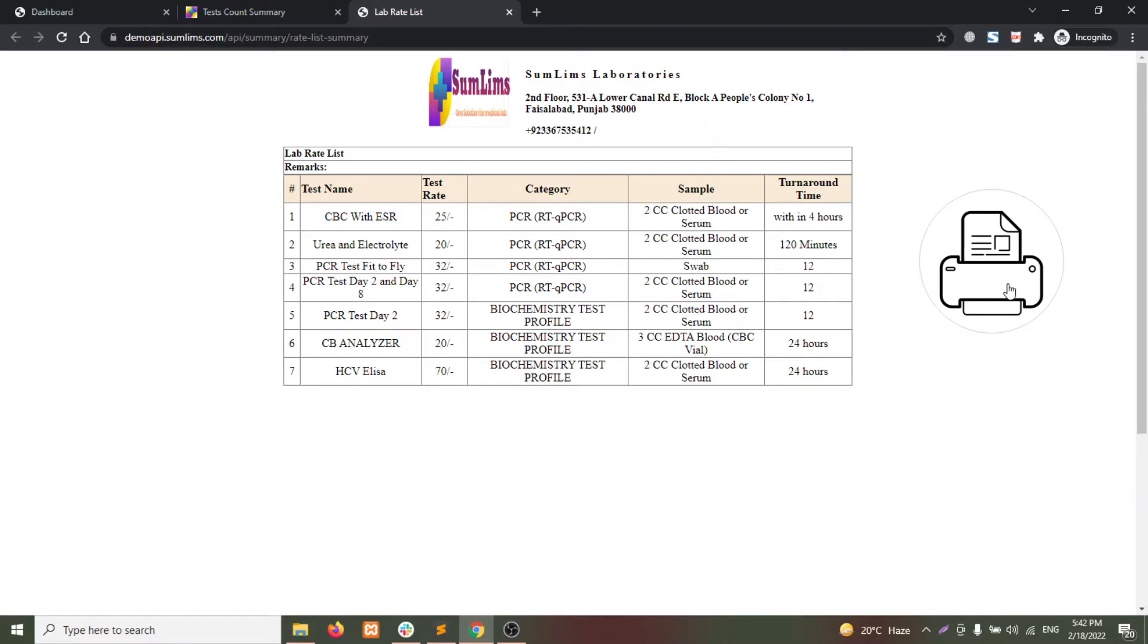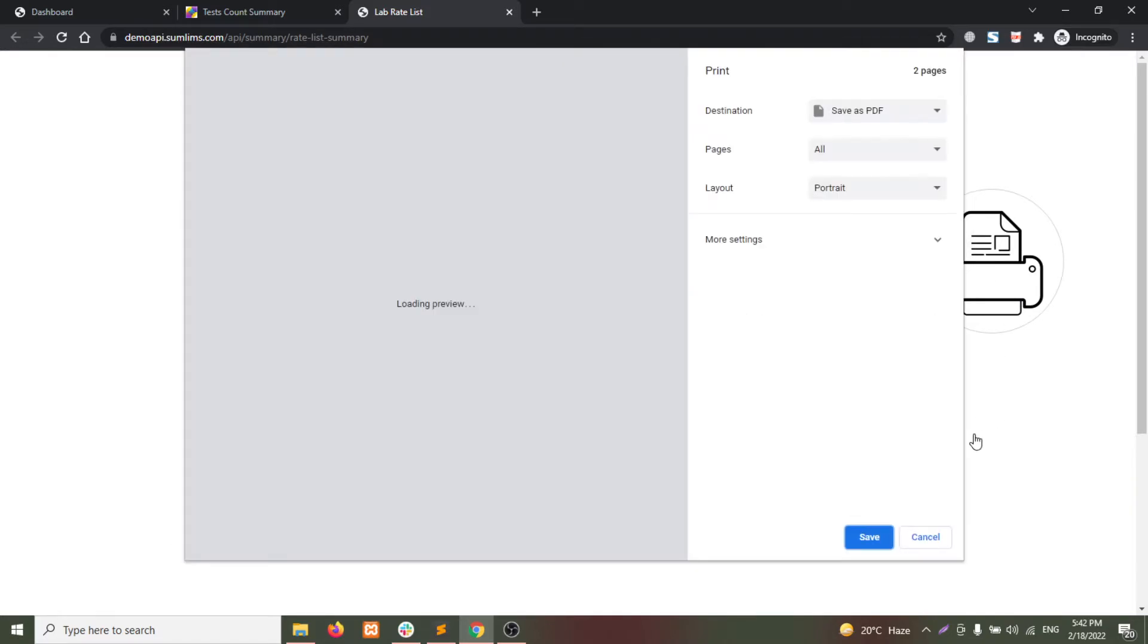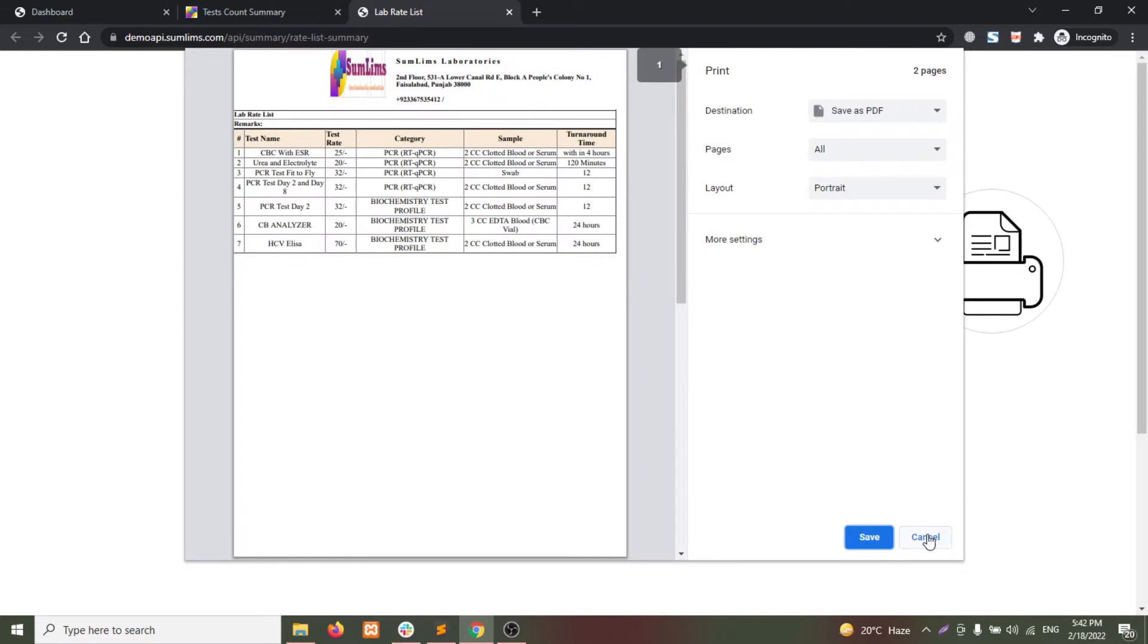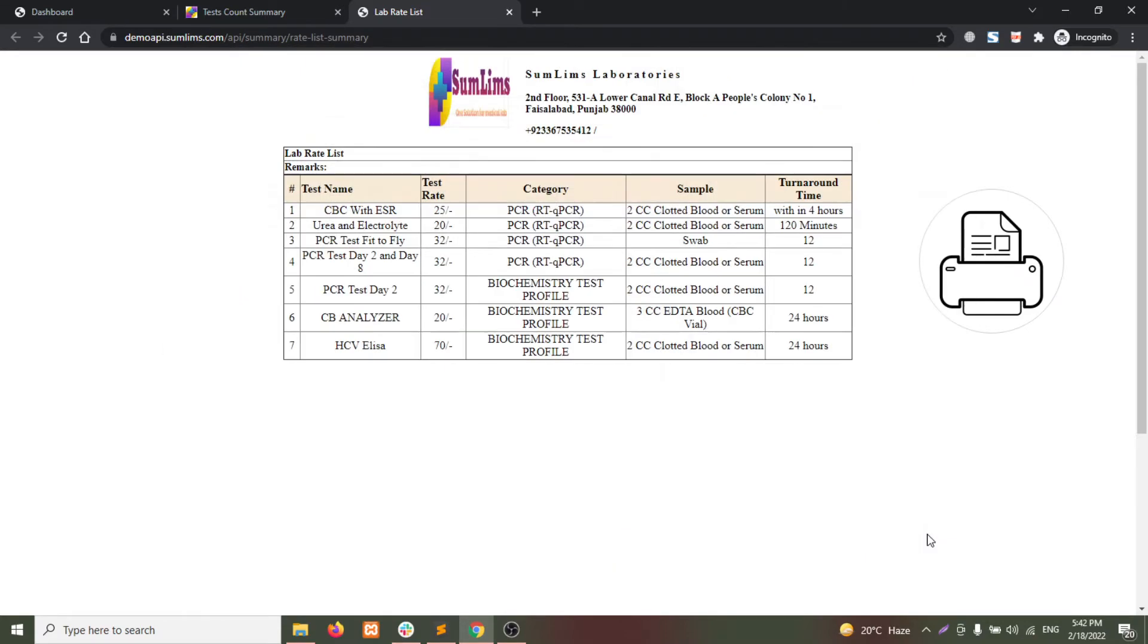You can click on the print button to print the list with the attached printer.